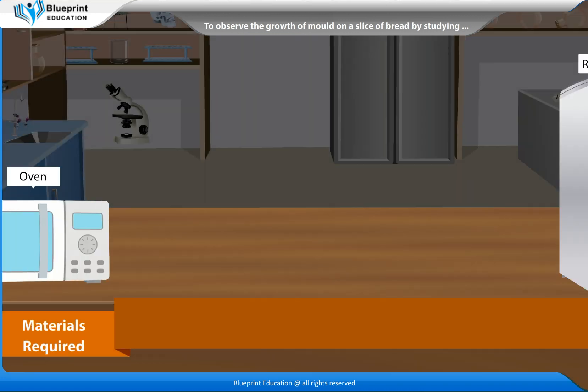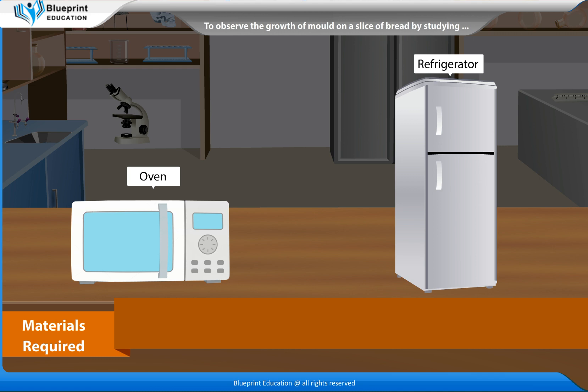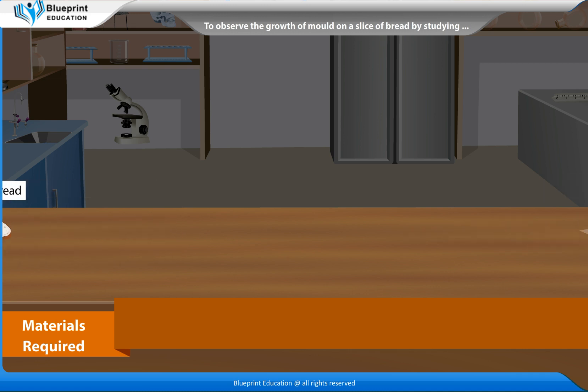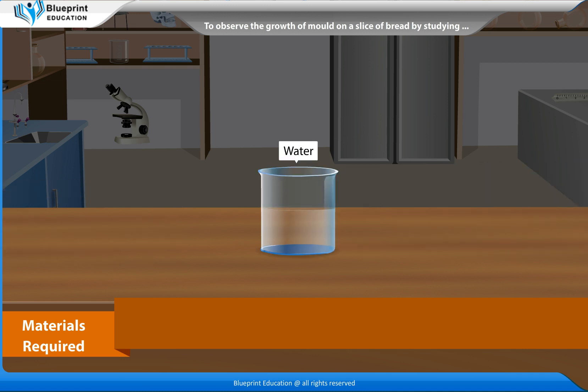The materials required are an oven, a refrigerator, three slices of bread, three plastic bags and water.